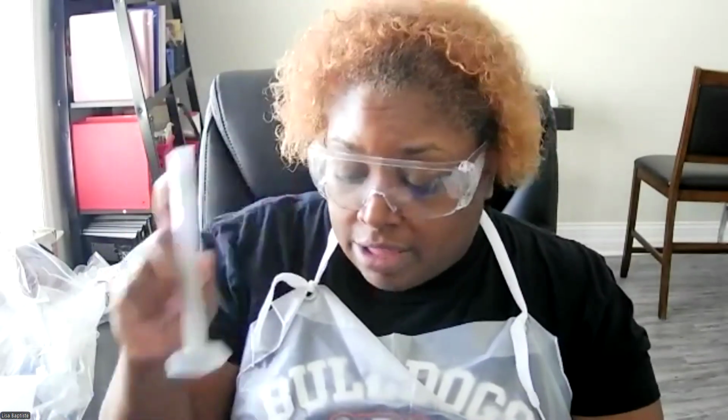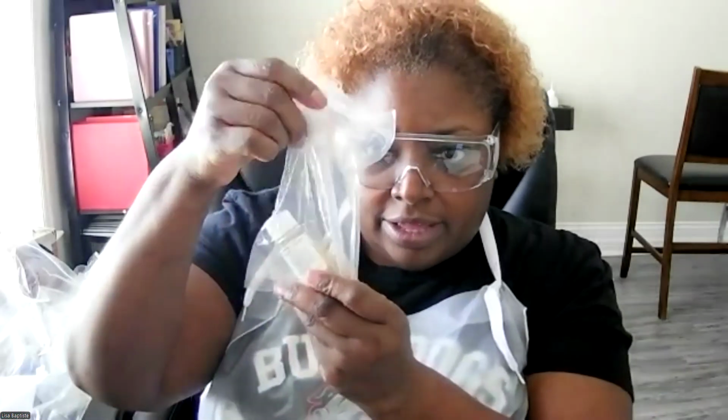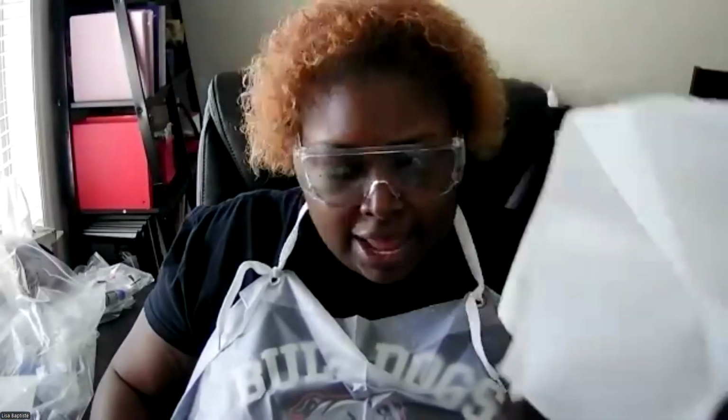And then your 10 mL graduated cylinder. Remember, this is what we use to measure all of our volumes. And then the dropper pipette, and paper towels, and a water bottle with either bottled or purified water. If you have a water purifier in your home, that's perfectly fine.